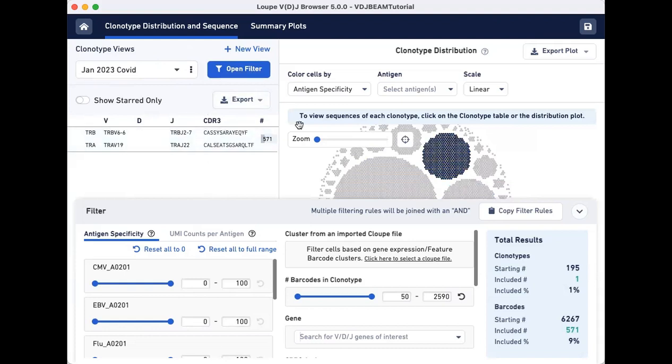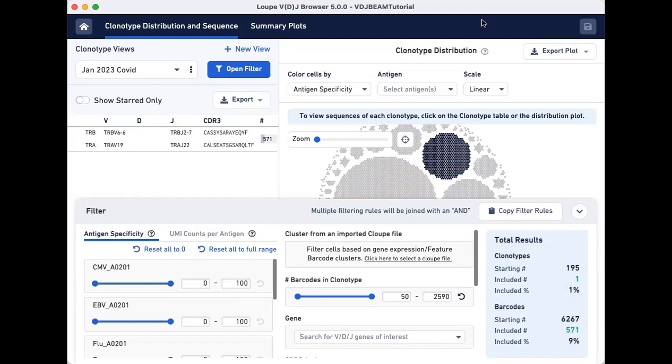To save these settings to your VLOUPE file for future use, click on the save button on the top right. You can also save to a new VLOUPE file by selecting file, save as, and entering a new file name.